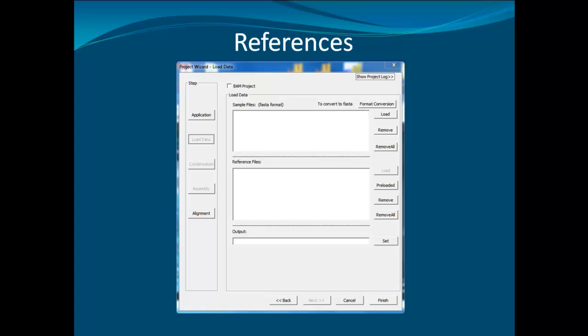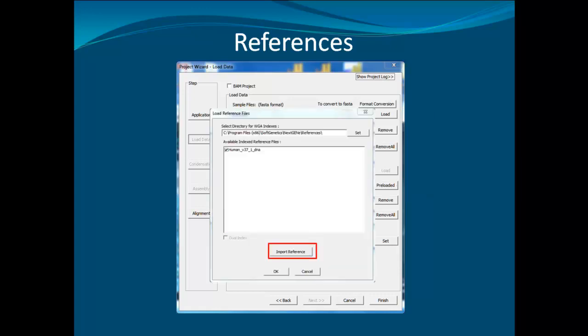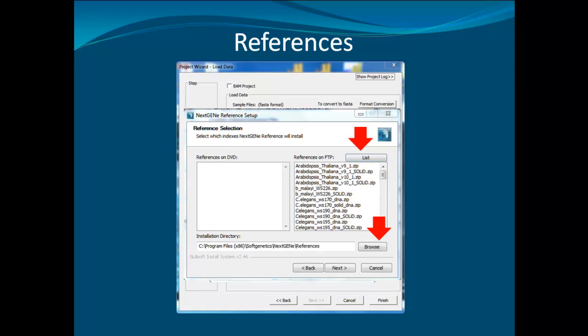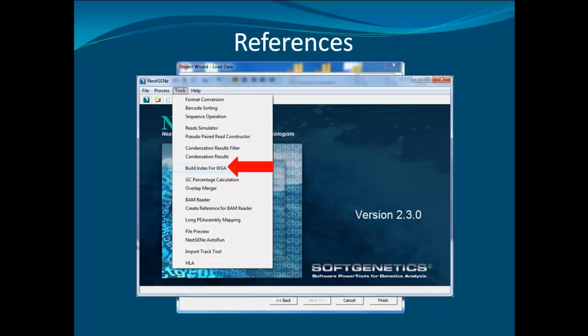Once you have finished, go back to the Load Data window of the Project Wizard. Load the converted data along with the preloaded reference. In the preloaded reference window, select the genome of interest or select Import Reference. Click on List to populate a list of genomes, select the genome of interest, and specify the installation location. If the genome you need is not in the list, you can use the Build Index for WGA tool in NextGene to generate a reference from GenBank files.